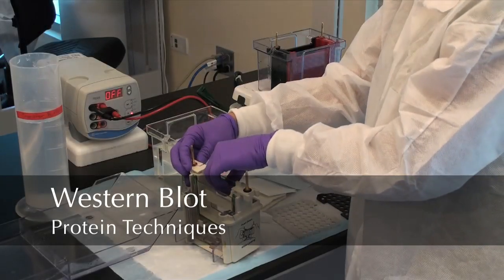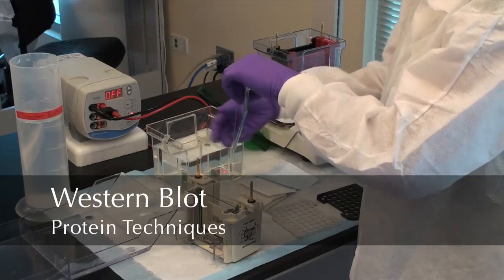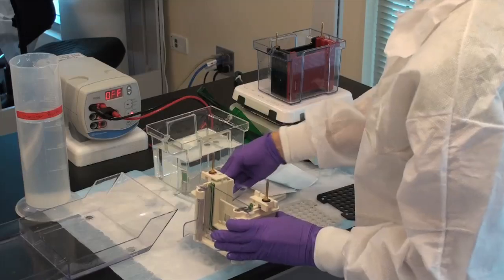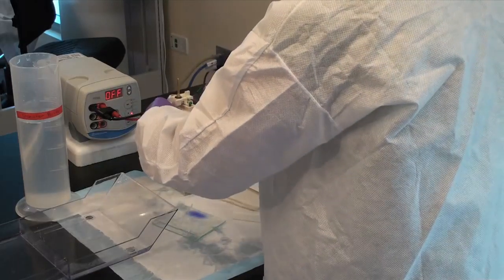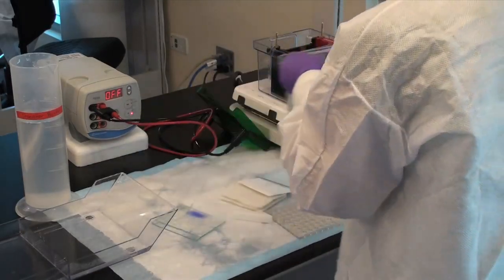Western blotting. When your gel has finished running, you should see that the dye front has moved to the bottom of your gel. Remove the gel from the electrophoresis tank and set up your transfer sandwich.